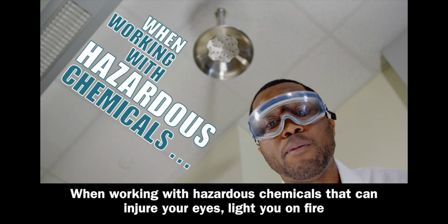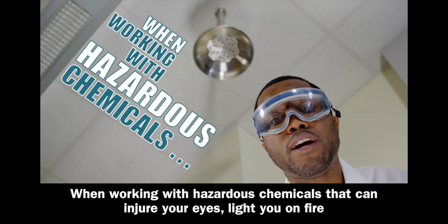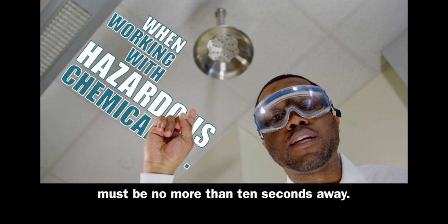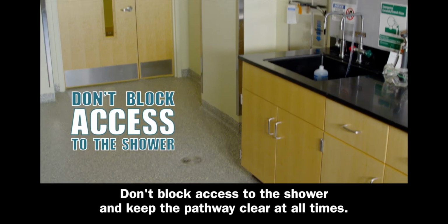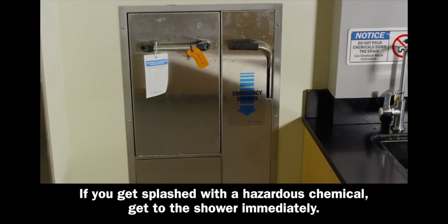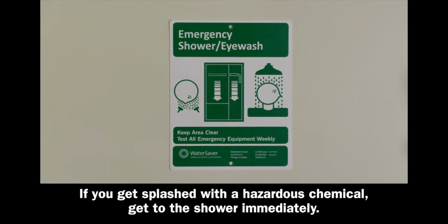When working with hazardous chemicals that can injure your eyes, light you on fire, or cause any harm to you, a working emergency shower must be no more than 10 seconds away. Don't block access to the shower, and keep the pathway clear at all times. If you get splashed with a hazardous chemical, get to the shower immediately.